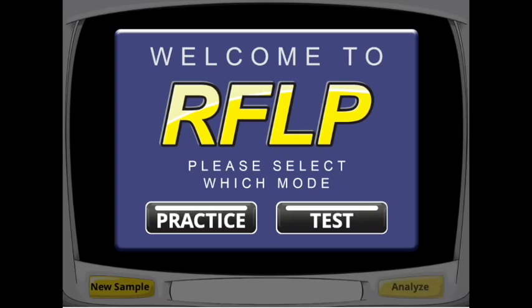Welcome to the RFLP simulation. In this simulation, you'll identify a patient sample for the presence of sickle cell anemia using restriction fragment length polymorphism testing. Begin by selecting either the practice or test mode.